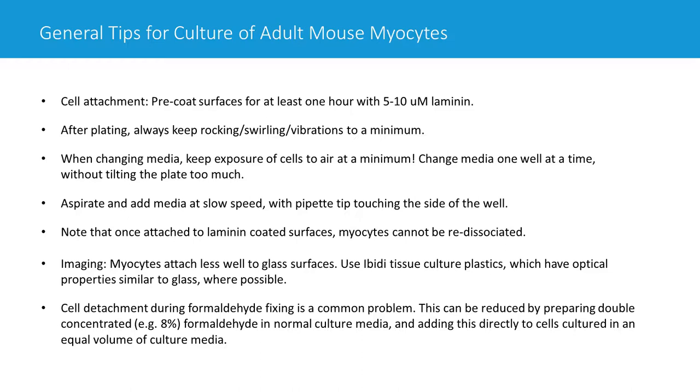A critical time when disturbances become more important is when you take the plate out to change the media — for example, switching from plating media containing FBS to culture media. Many people find their myocytes look wonderful beforehand, then after changing the media they're all gone, round, or both. We find that myocytes, especially early on, are not happy with exposure to air. For this reason, it's important to change media one well at a time — aspirate, then add media — rather than aspirating all wells first.